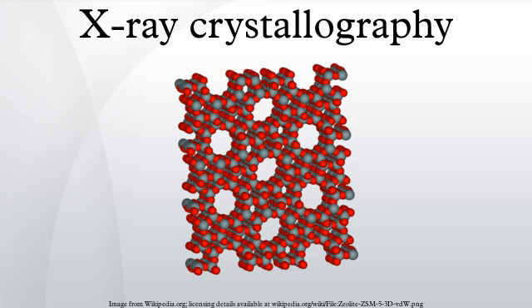The Laue back reflection mode records X-rays scattered backwards from a broad spectrum source. This is useful if the sample is too thick for X-rays to transmit through it. The diffracting planes in the crystal are determined by knowing that the normal to the diffracting plane bisects the angle between the incident beam and the diffracted beam. A Greninger chart can be used to interpret the back reflection Laue photograph.